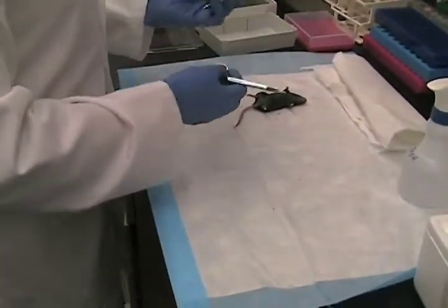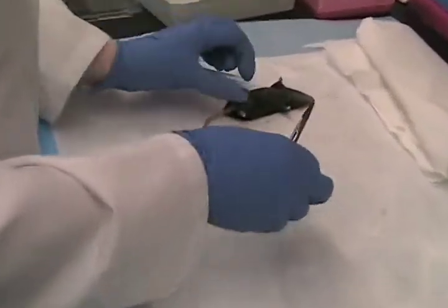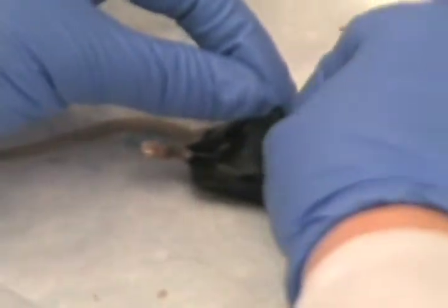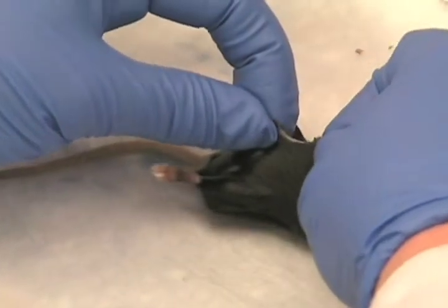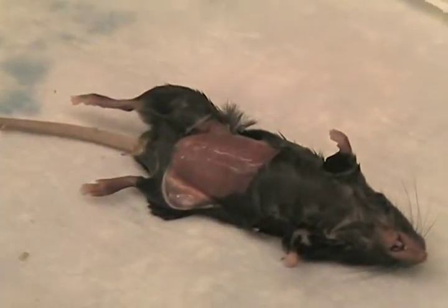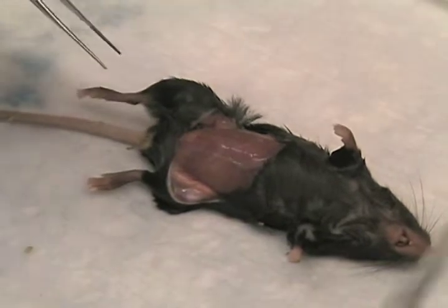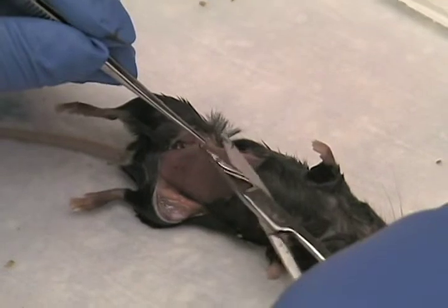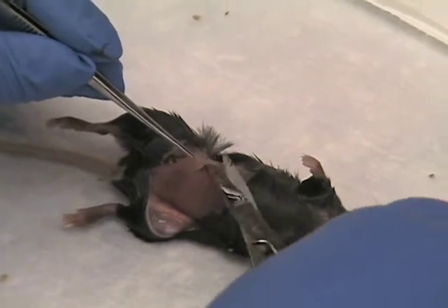Take pretty blunt forceps and scissors. First thing you want to do is pinch the animal right around the midline, go ahead and make a first cut, and then from that point you can just pull the skin apart, exposing the abdomen of the animal. There's a thin layer of the peritoneum that you're going to pull up with the forceps, and then you can cut apart with scissors.